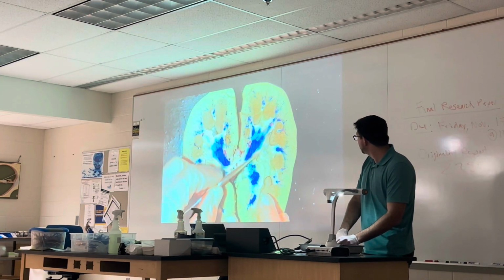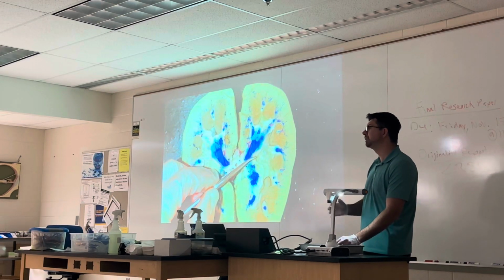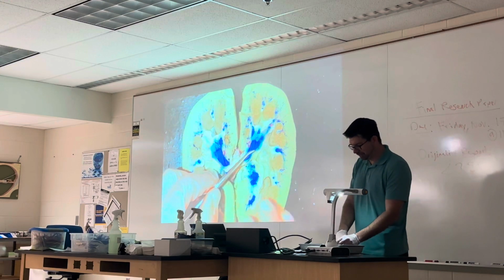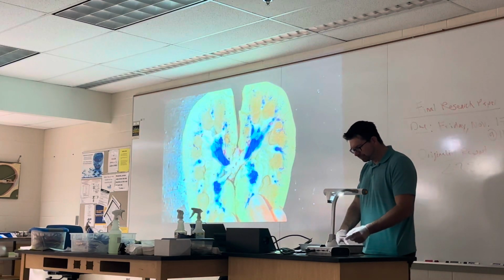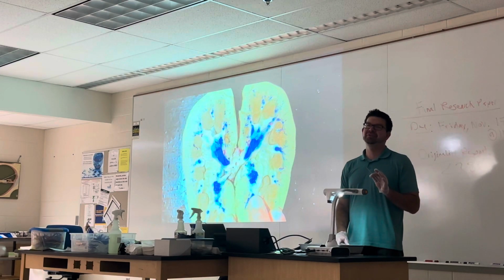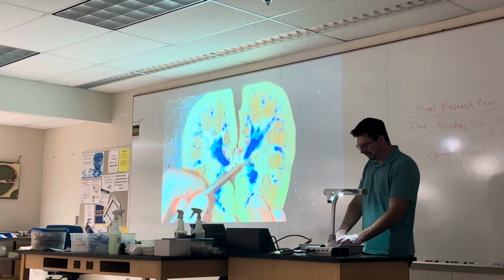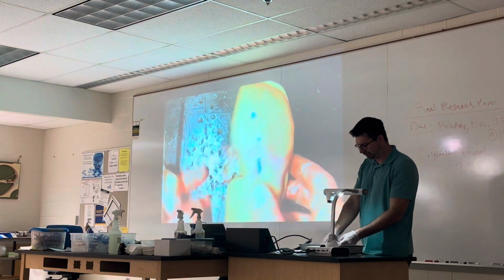All right, when you get over here, this area right here then is the renal pelvis. So again, you have urine that goes to a minor calyx, to a major calyx, to a renal pelvis. So this area over here would be a renal pelvis. Again, it looks like they put an excessive amount of dye in here because this area should not be all blue. But this would be the renal pelvis area here, and likewise here.